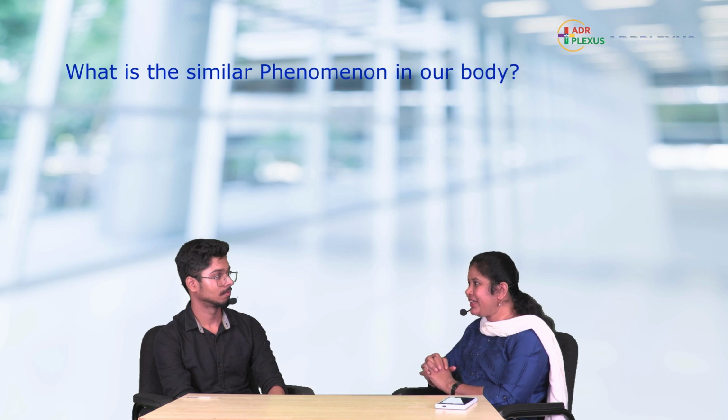Now let us get into some depth of the optics of the light. What is resolution power? Resolution power is basically the ability of the lens to reveal adjacent structures as clear, separate and distinct, ma'am. Does this sound similar anywhere in our body? Yes, ma'am. It's more or less similar to visual acuity, ma'am.